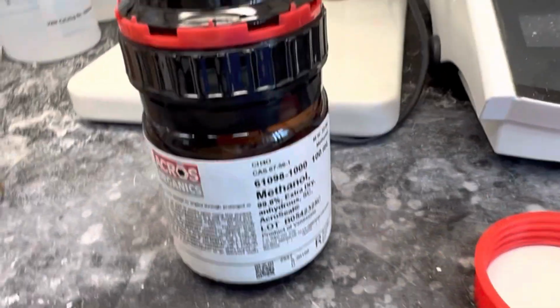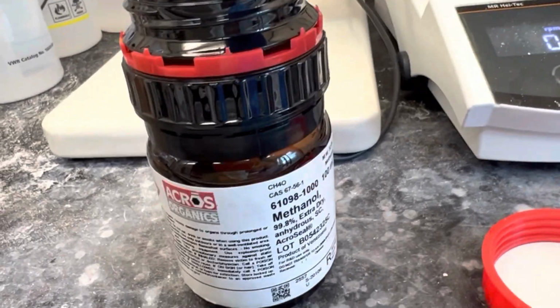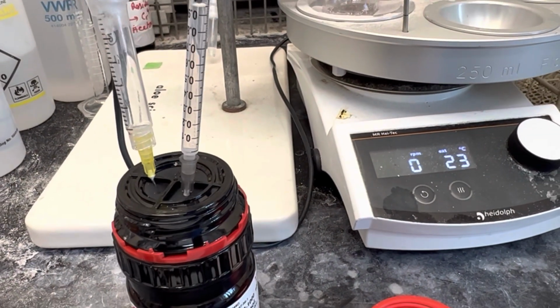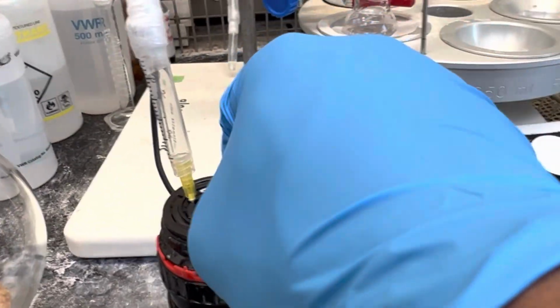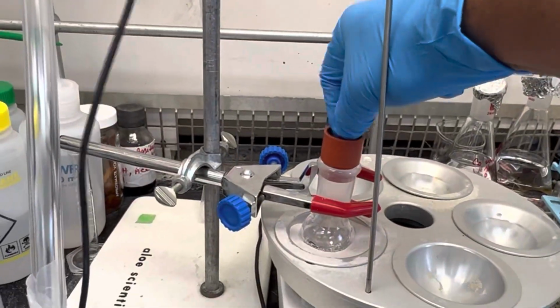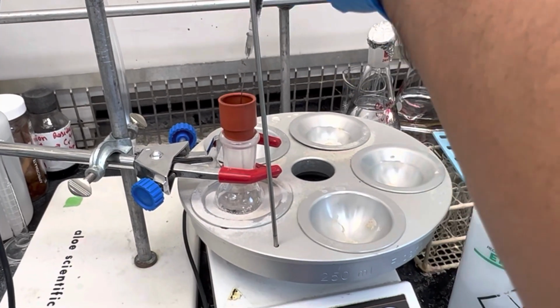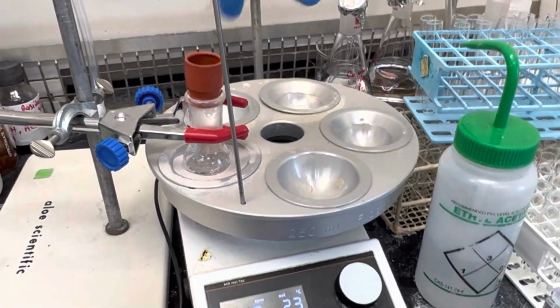So just add methanol. Here I'm adding anhydrous methanol. You can use regular methanol, but it needs to be pure. Using anhydrous methanol is safe, because at least it is pure. It doesn't matter whether it has water or not, but it will be pure.